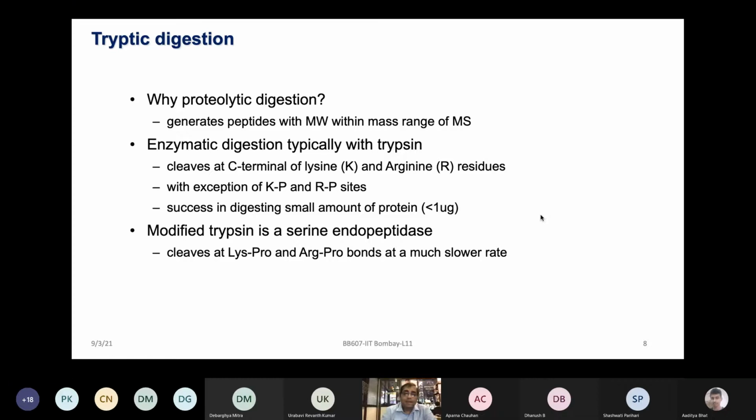So ideally I would like to ask more of this question that I have in my slide, but let me now give you a broad overview. Since we are talking about different types of mass analyzers, as you have learned, different mass analyzers like quadrupole versus time of flight are very different in terms of what kind of masses they can separate and resolve. So many of the mass analyzers can only take a limited mass range. Only TOFs are quite exceptional in that way.